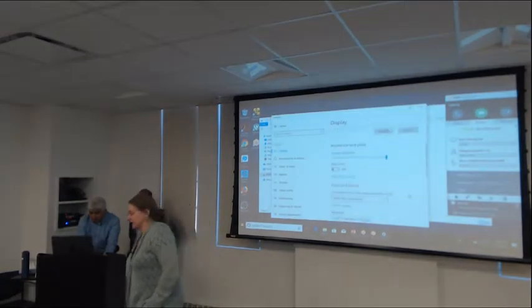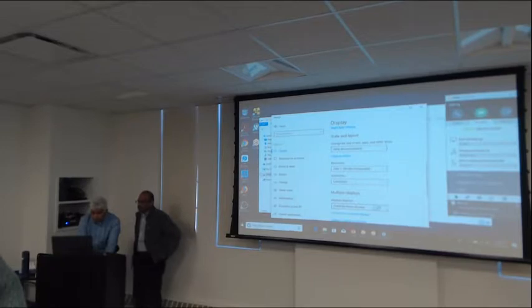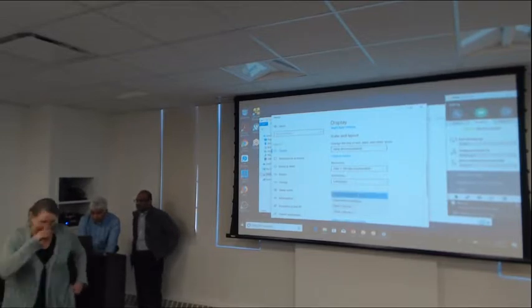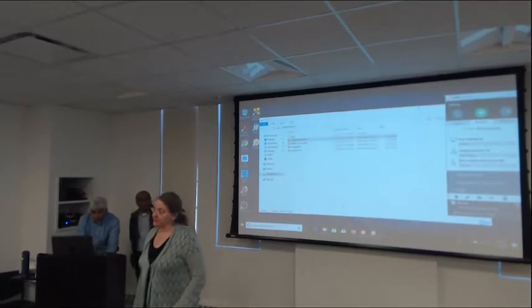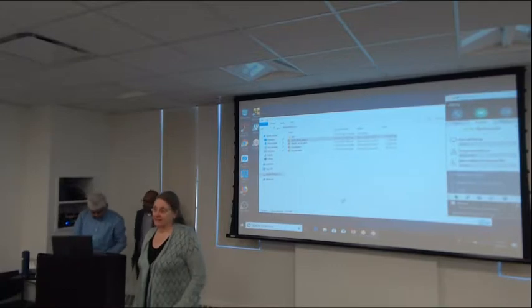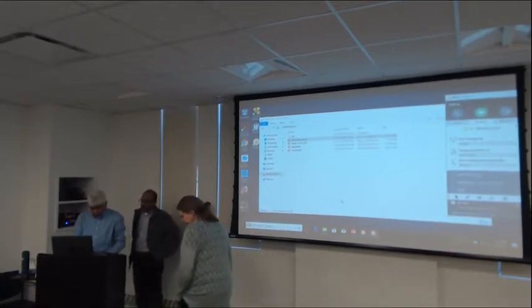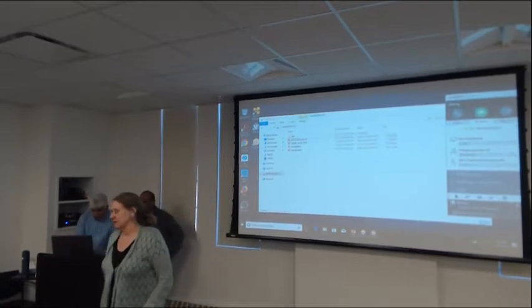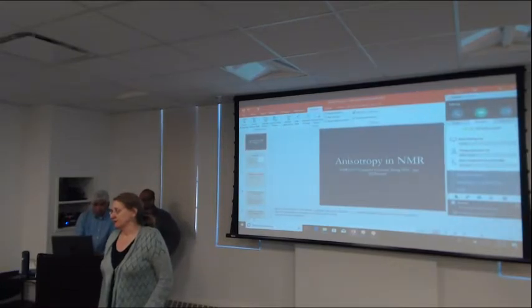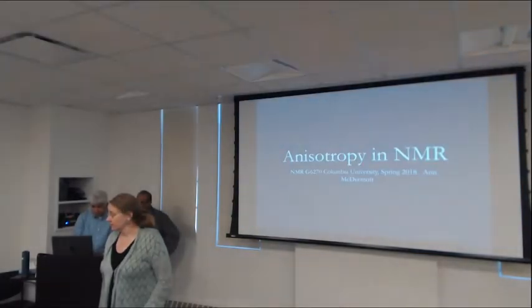So we're going to follow the notes kind of closely, but maybe try to find some more time for discussion so we can go through it point by point. And the idea in the first segment today, tomorrow, is to talk about orientation-dependent interactions and a mathematical description for them. That's where we're headed. The motivation comes from lots of NMR experiments in solution and in solid state. In solution and solid state, you can talk about similarities and then you can talk about contrasts.